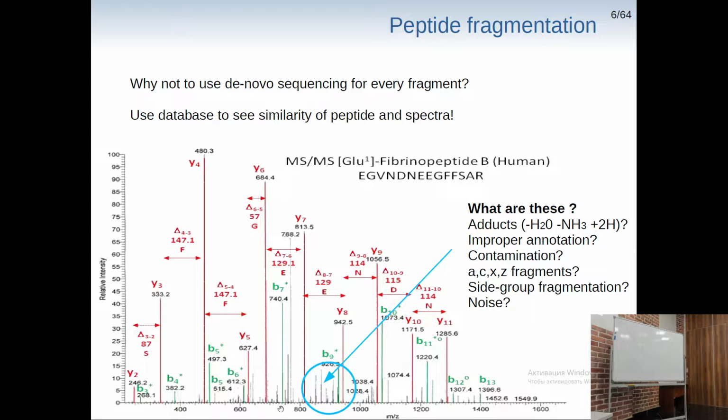There are some small peaks which are smaller than the neighboring peaks, but which are assigned, and so on, right? So, if you did not know the sequence of your peptide beforehand, it would be a bit troublesome to do de novo sequencing from this data.